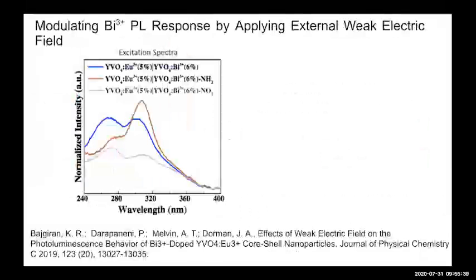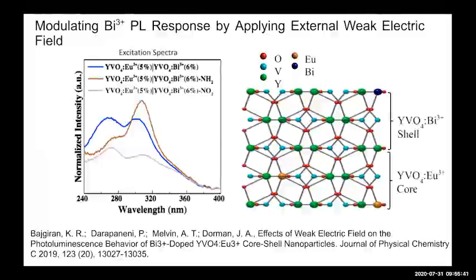This is a slide about previous work in this topic. Using this as a reference, after synthesis, the PL properties were scanned to see whether the excitation spectra looked similar.